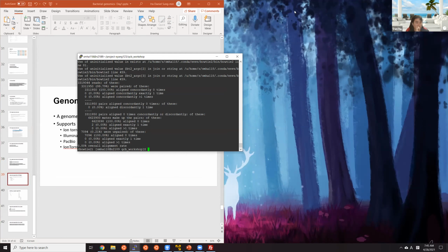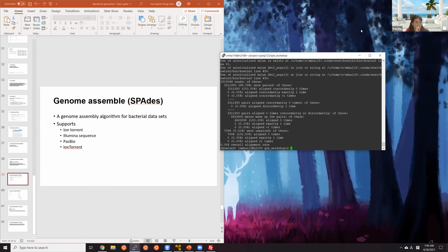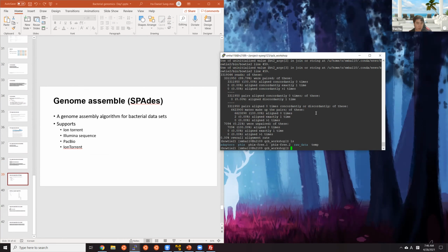So I guess bowtie is done. Let's see if we have the output. Yeah, so basically we have two PhiX free read files.